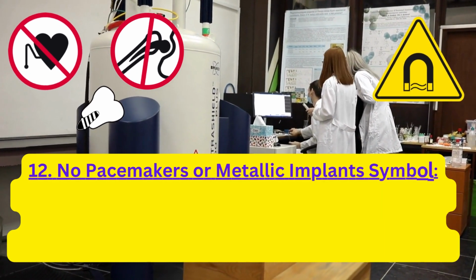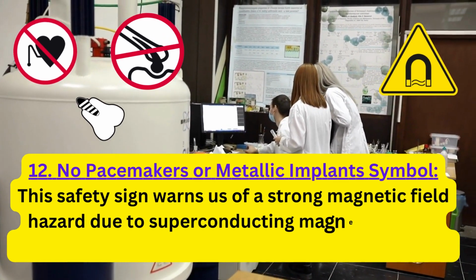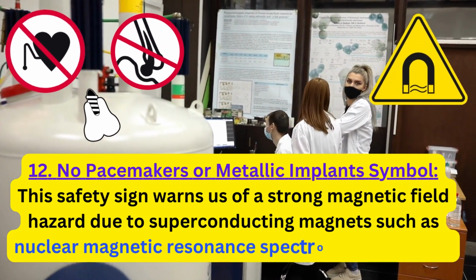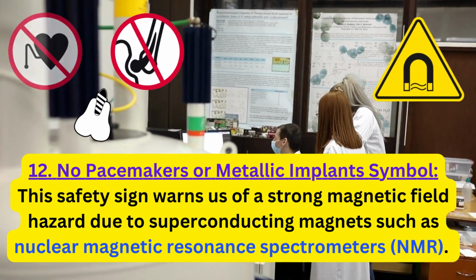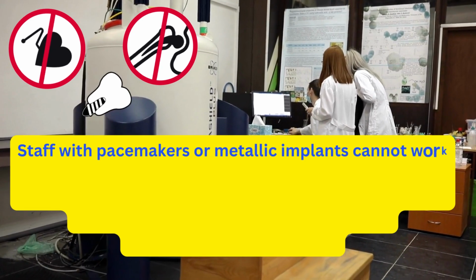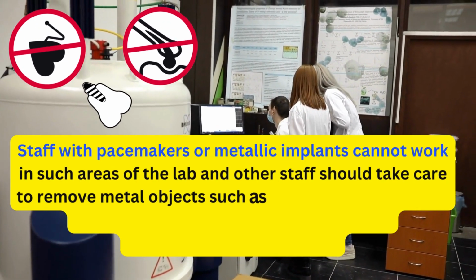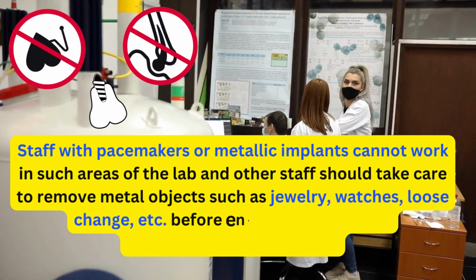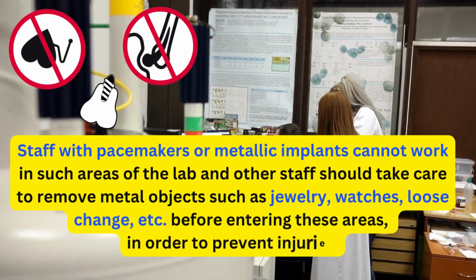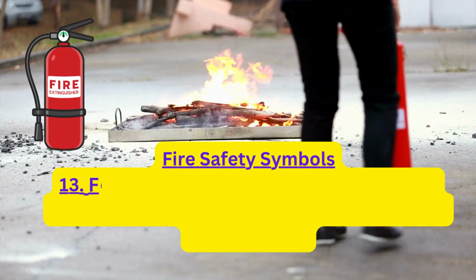12. No pacemakers or metallic implants symbol. This safety sign warns us of a strong magnetic field hazard due to superconducting magnets such as nuclear magnetic resonance spectrometers (NMR). Staff with pacemakers or metallic implants cannot work in such areas of the lab, and other staff should take care to remove metal objects such as jewelry, watches, loose change, etc., before entering these areas in order to prevent injuries. Fire safety symbols.